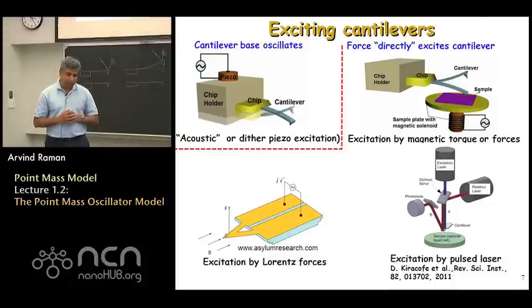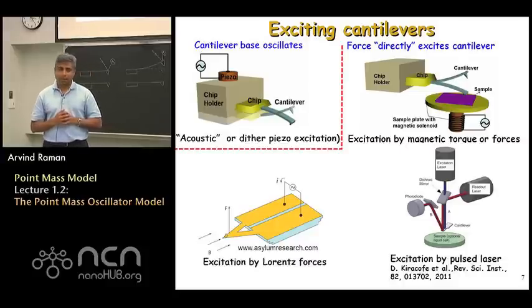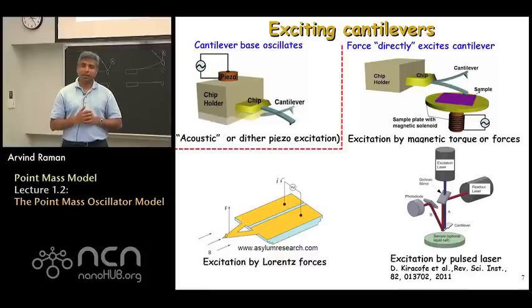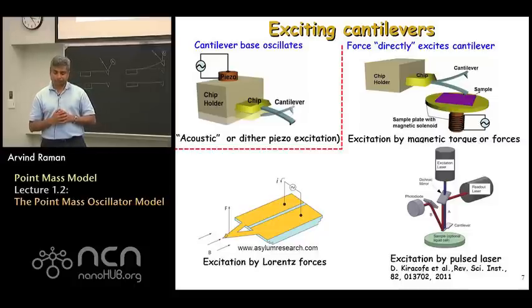In dynamic atomic force microscopy, there are many, many different ways by which you might be able to excite cantilevers. On the top left is shown a common method, probably the most common method, which is the dither-piezo excitation, or sometimes called acoustic excitation as well.